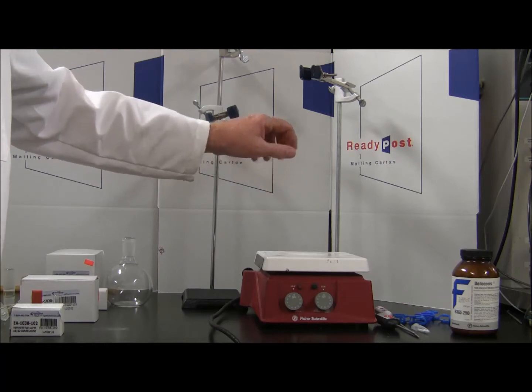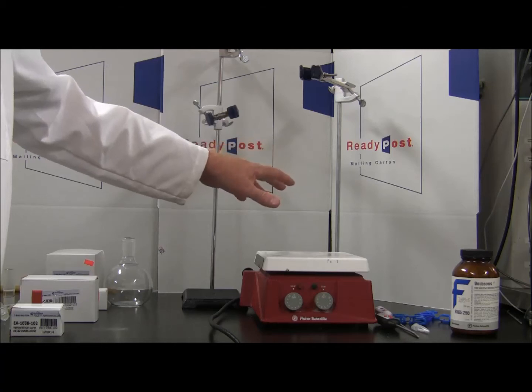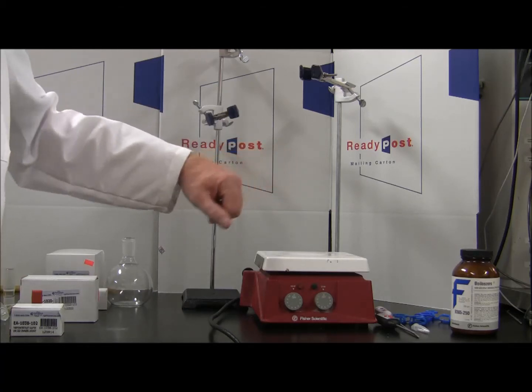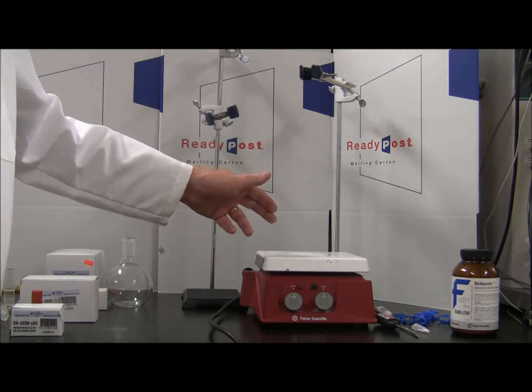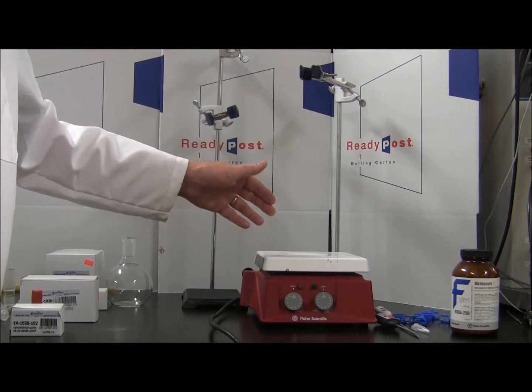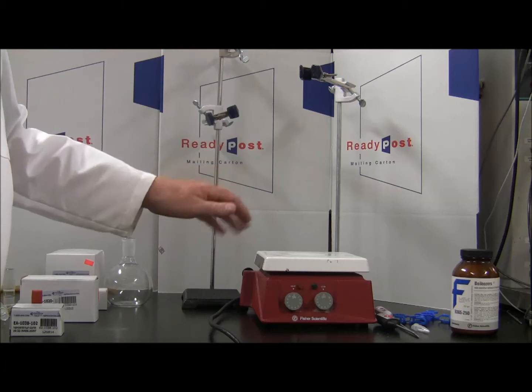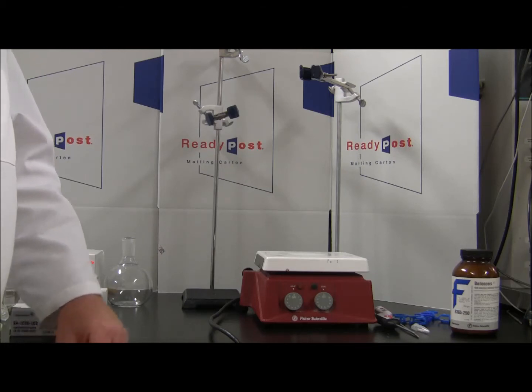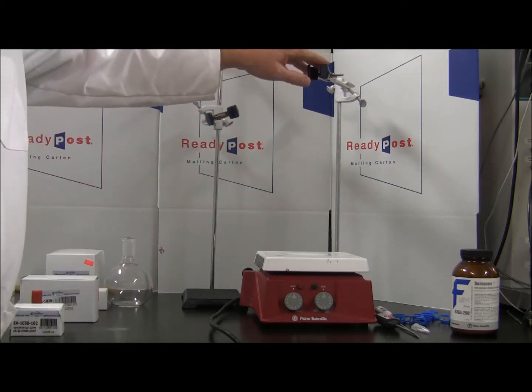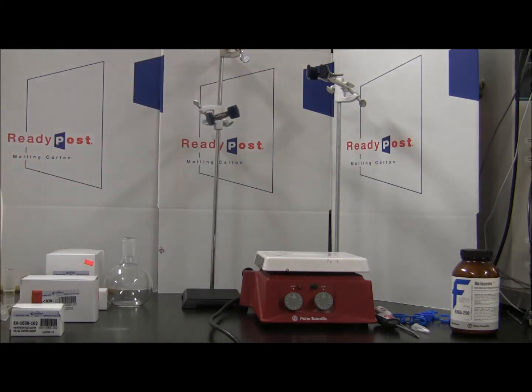Hot plate needs to be supplied by you. That's not part of the kit. If you don't have one in your classroom, check with maybe some other departments in your school, or your ISD may be able to provide one as well. If not, you can go with a hot plate for home use. Do not use Bunsen burners or anything with flame, as you're dealing with ethanol, which is a flammable product. Also included in the kit are your stands and your clamps to be able to hold your apparatus in place.